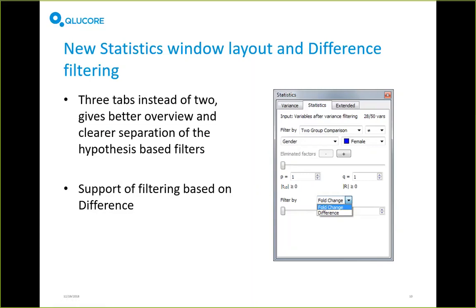That was what I wanted to say about the software in the presentation. Now I'm going to give you a brief walkthrough of a couple of the new features that we've added in 3.5.